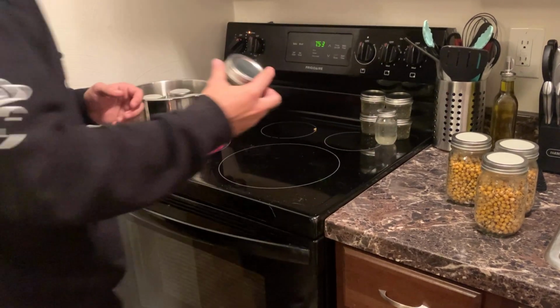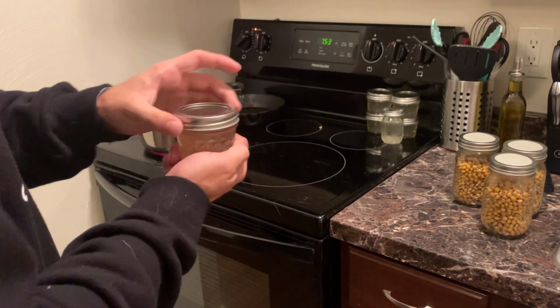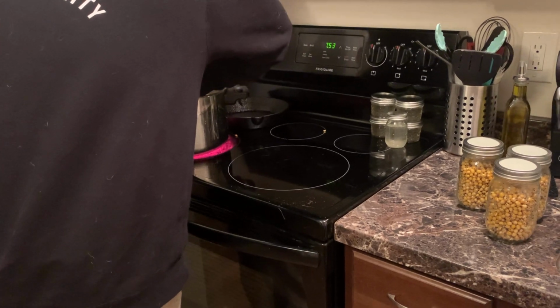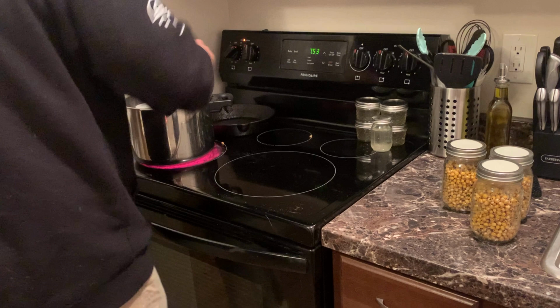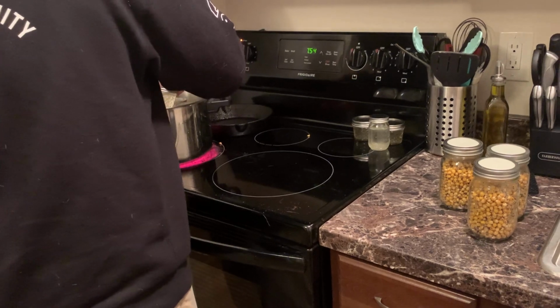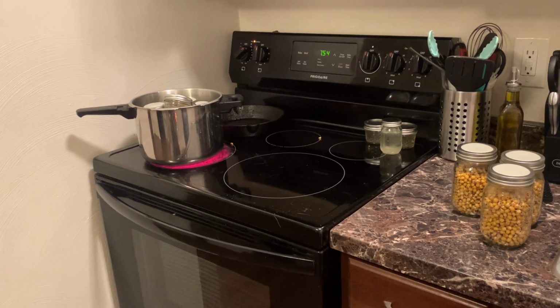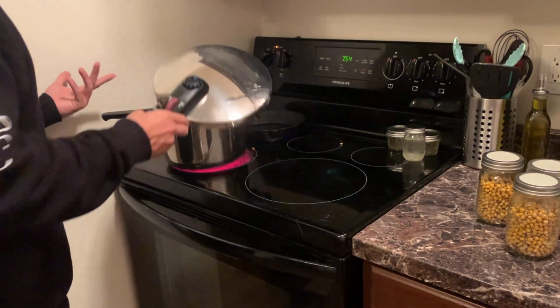And then I'm also going to sterilize my liquid culture jars as well. And it doesn't have to look nice in there. You can just throw it in there so it fits. And then you're basically just gonna throw your lid on.